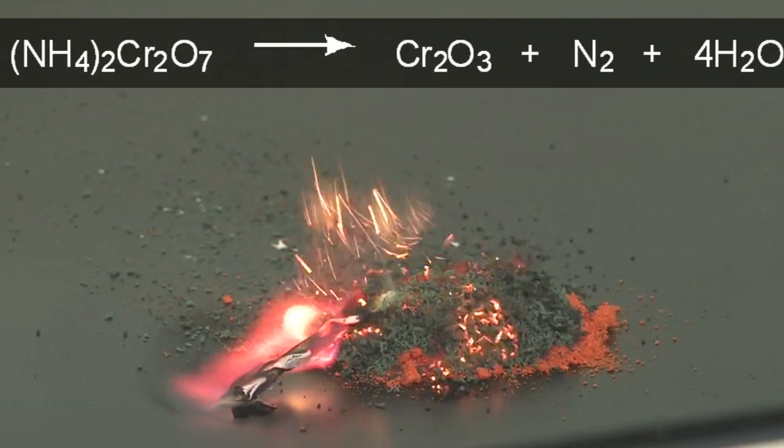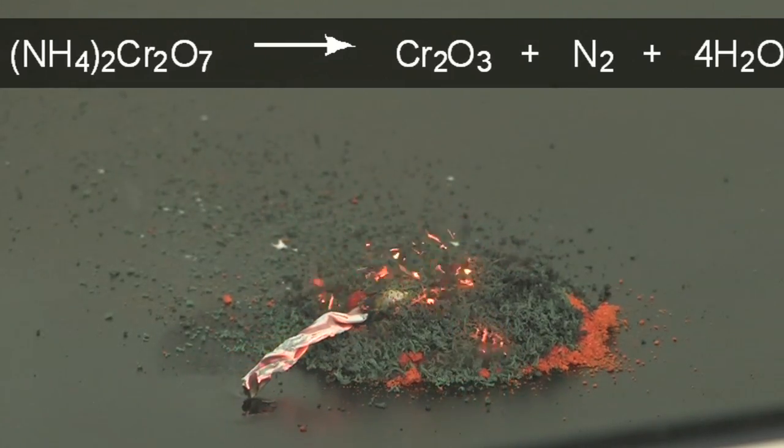Ammonium dichromate decomposes to chromium oxide, which is the dark green solid that we can see.